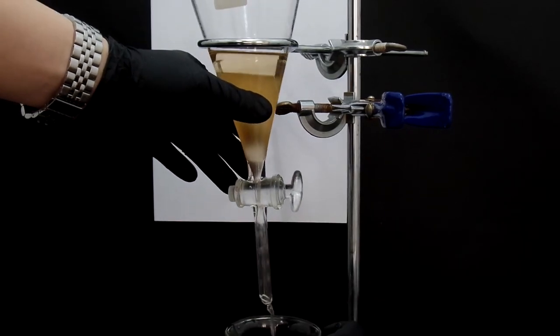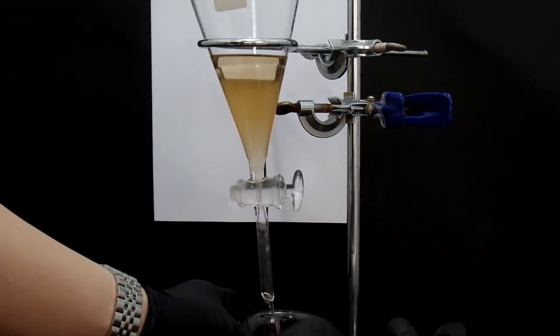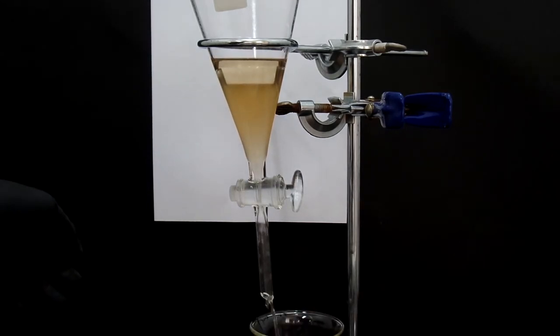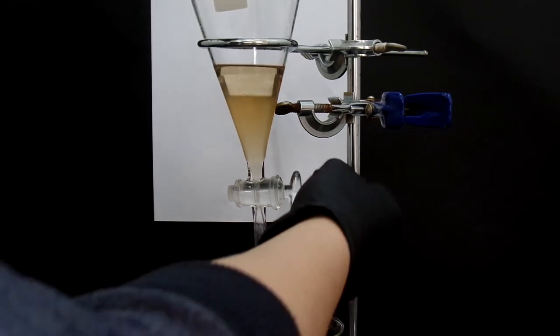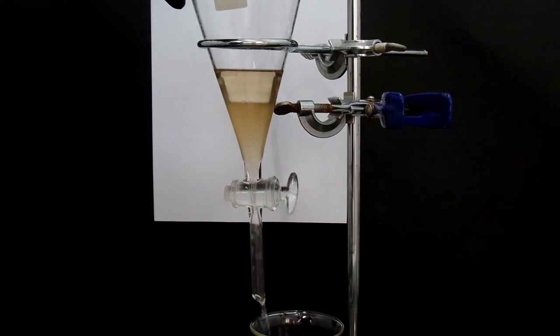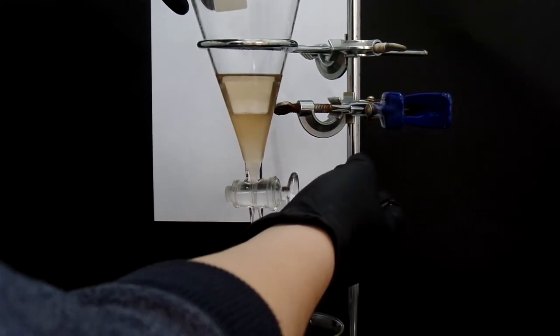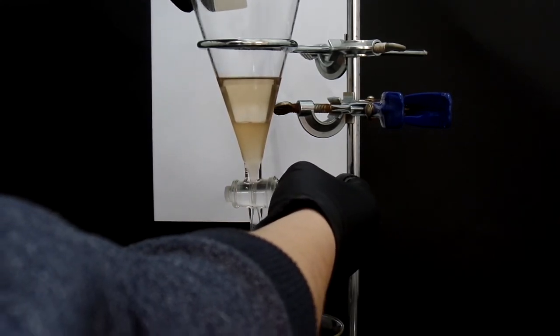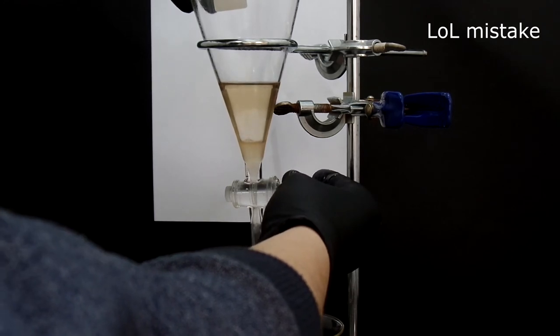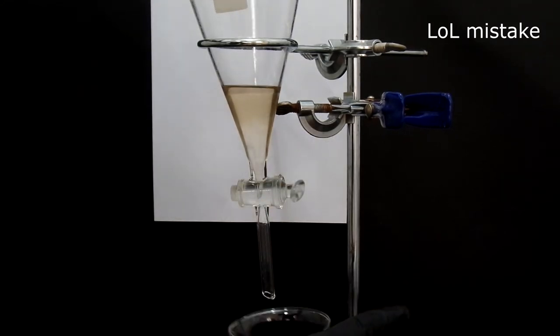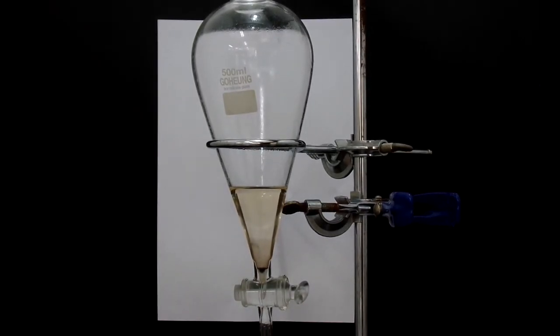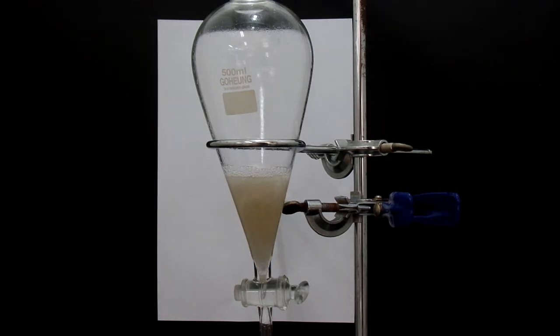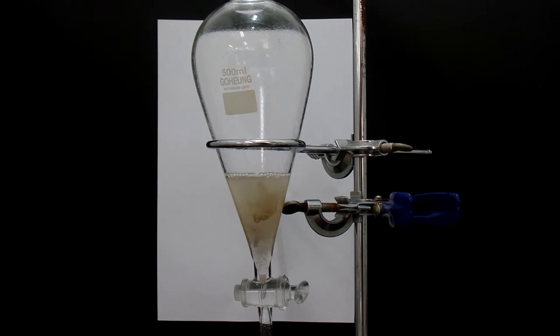After the layer is separated, the lower aqueous layer is discarded. Then add saturated sodium bicarbonate solution to neutralize remaining acid. This is important because you don't want your ester to smell like vinegar. Again, lower layer is discarded.